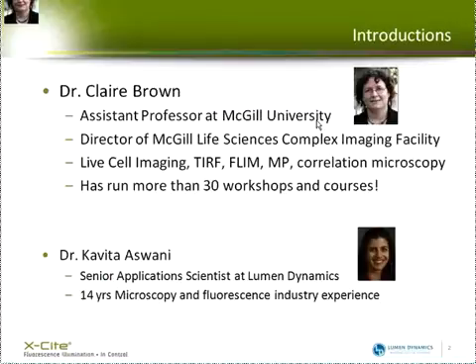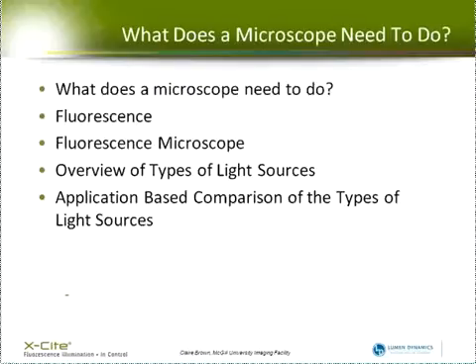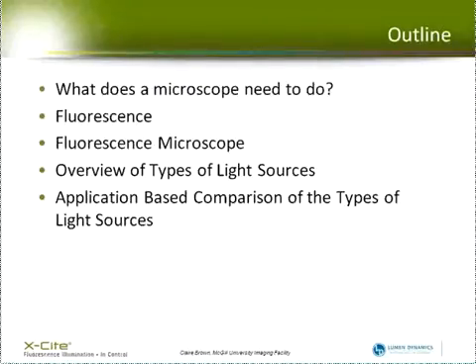Okay. Thank you very much for that kind introduction, and I welcome everybody here this morning. So basically, when I started thinking about this presentation, I thought we really need to have the light sources in context. So I'm going to spend a little bit of time just on some background of what does the microscope need to do in order to answer your research questions, a little bit of background on fluorescence and the fluorescence microscope. And then I'll go through an overview of all the different types of light sources, and then finish up with a comparison of the different light sources based on certain applications.